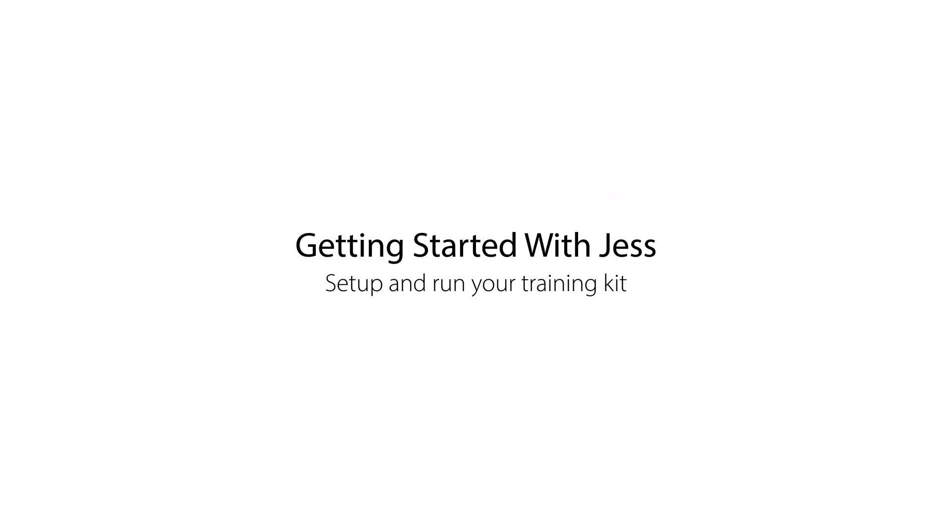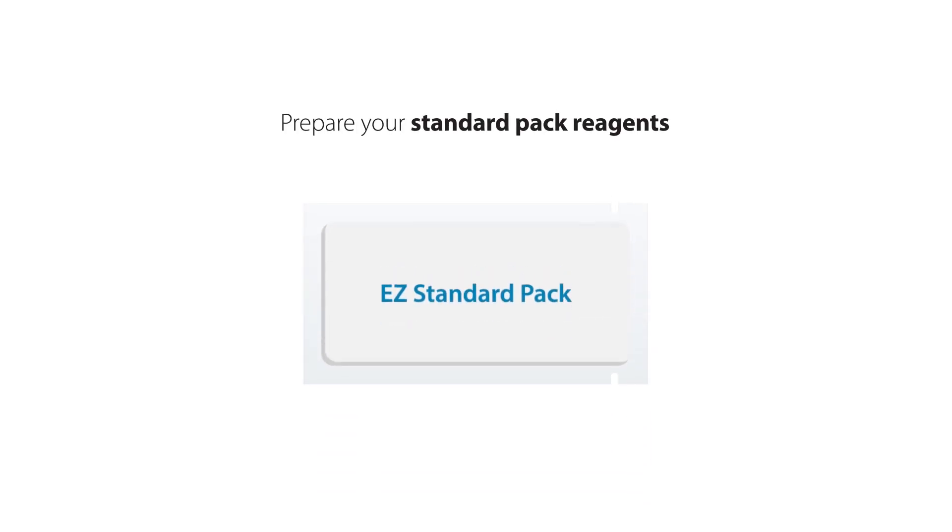We're going to teach you how to set up and run your training kit on Jess. Start by preparing your standard pack reagents.